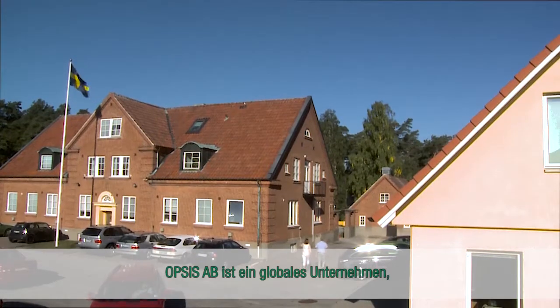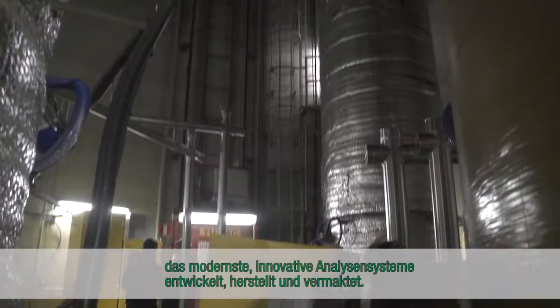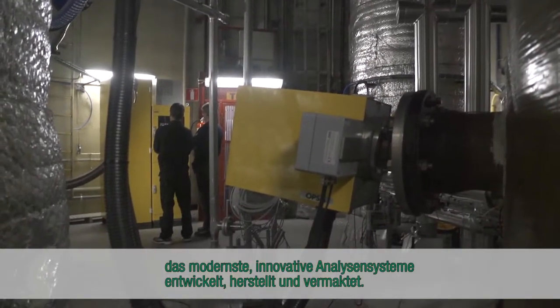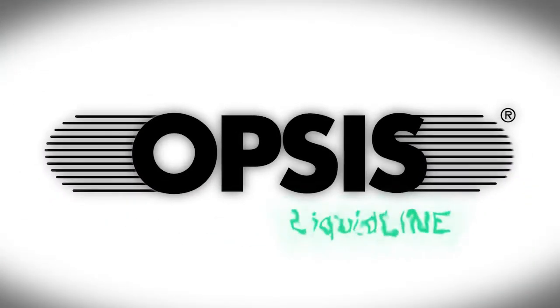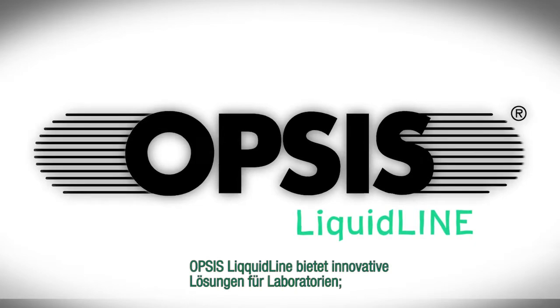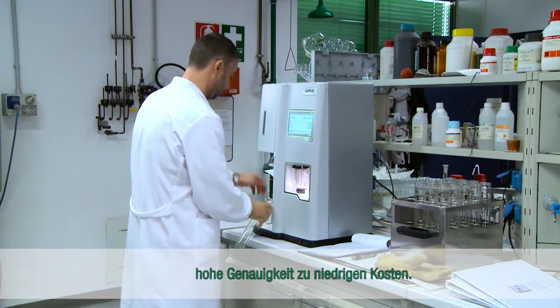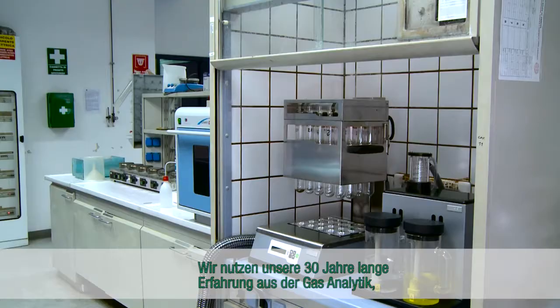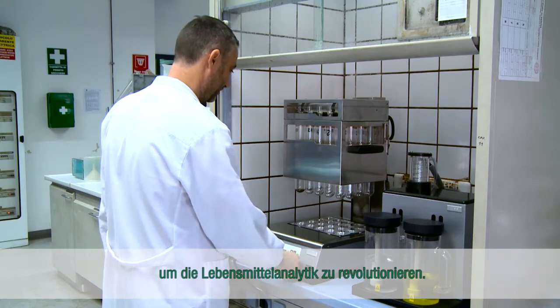Opsys is a global company that develops, manufactures and markets state-of-the-art innovative analysis systems. Opsys LiquidLine brings innovative solutions for laboratories, offering high precision at low cost. Opsys uses 30 years of experience in gas analysis to revolutionise food analysis.